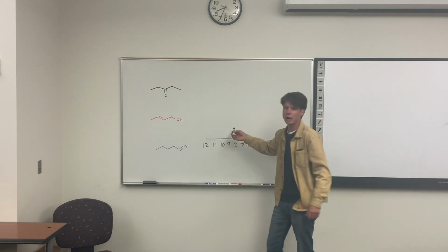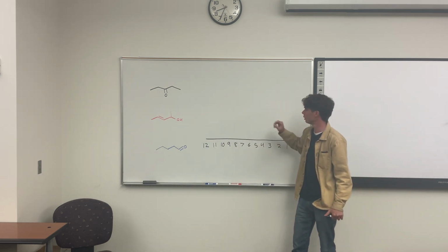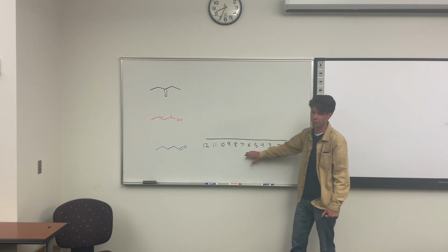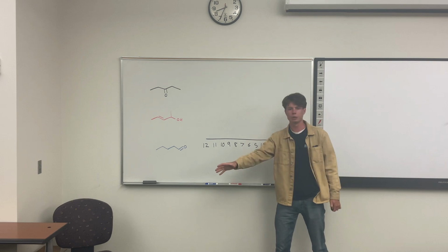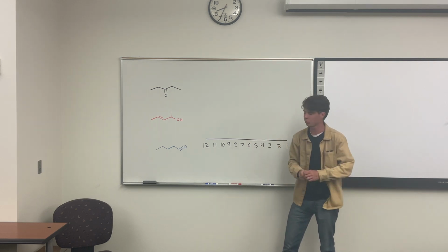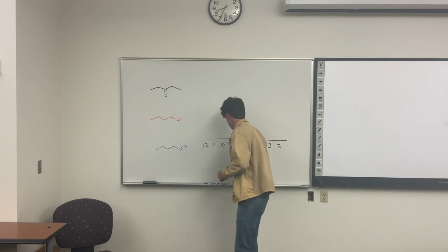So I'm going to start the same way, and the last thing I'm going to do is put it oriented on what I made here. HNMR goes from like 1 to 12. CNMR goes up to beyond 100. I can't quite remember.